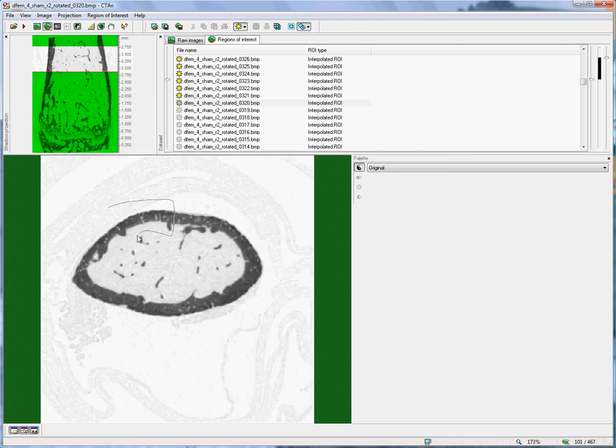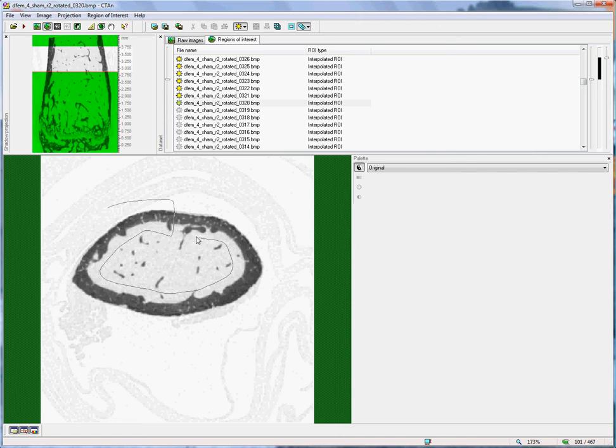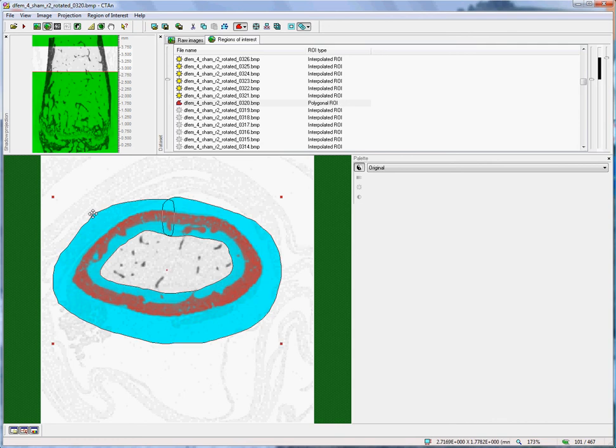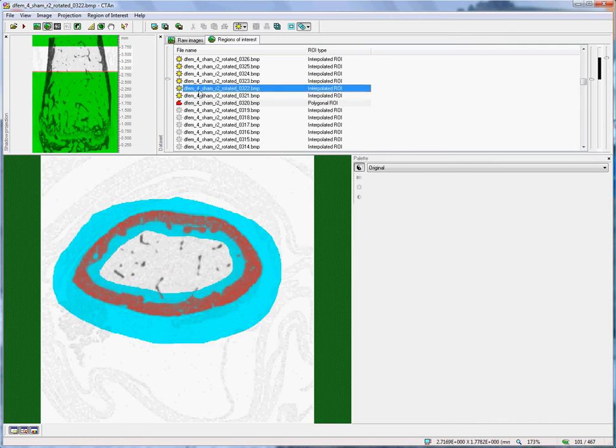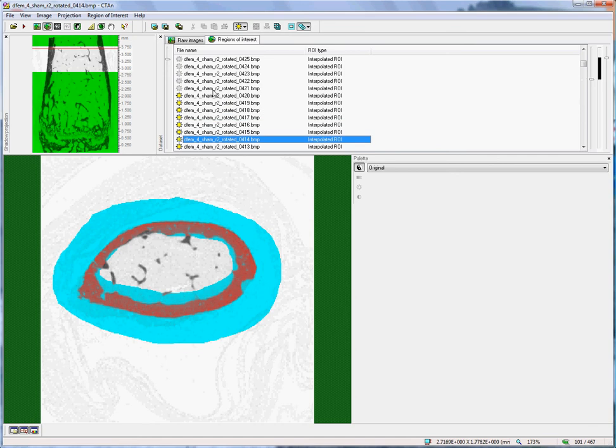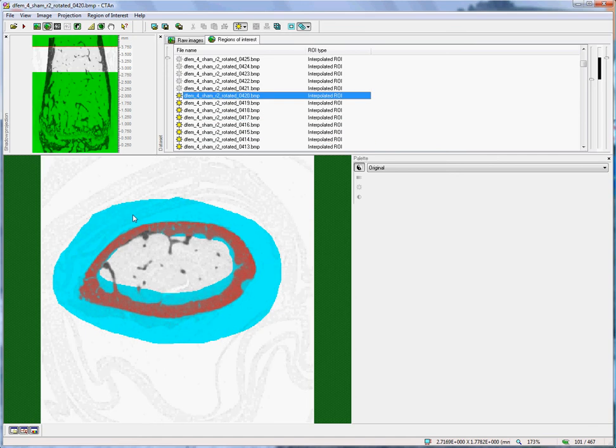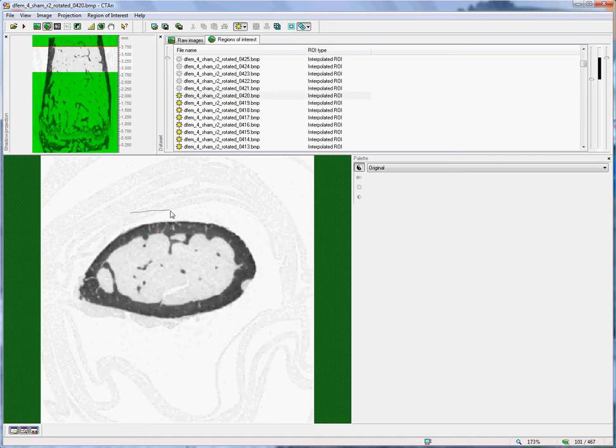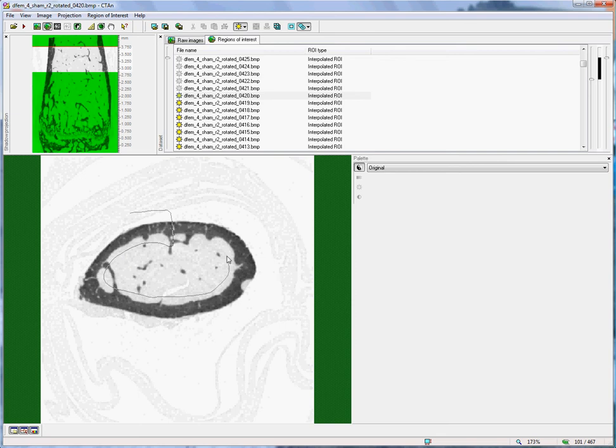We can draw a region of interest, something similar to a horseshoe which overlaps on itself and then travels outside the cortical bone. It's usually sufficient to do this at the top and the bottom slices of the selected range only. We will not exclude 100% of the trabecular bone by doing this, but we will exclude most of it.